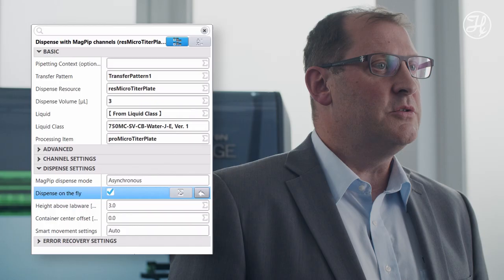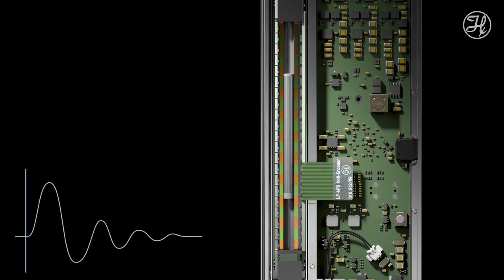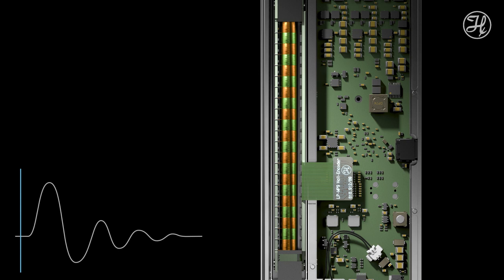For small volumes of down to 350 nL, a different mode is used. In the so-called asynchronous mode, the piston accelerates very strongly and thus gives an impulse to the liquid. By a controlled counter movement of the piston back upwards, the amount of dispensed liquid is precisely regulated. Also in this mode, fine adjustments can be made to optimize the pipetting.